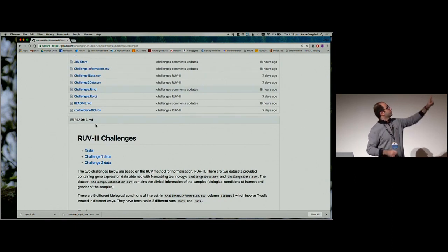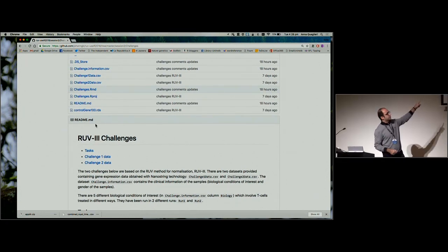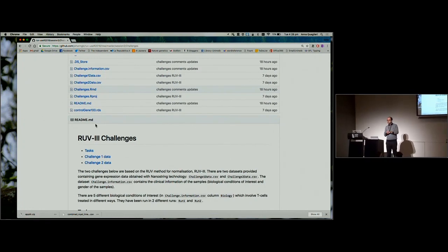This group uses data set 1. This group here uses data set 2. A group that receives over-adjusted, tell us why it's over-adjusted. A group that receives raw count should use these 100 genes to get it normalized, and tell us how normalization works. Time, start. This one is data set 1, and this group is data set 2.